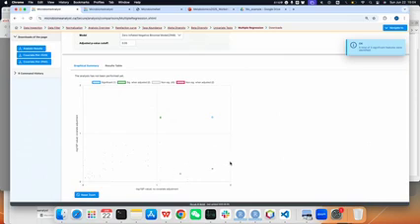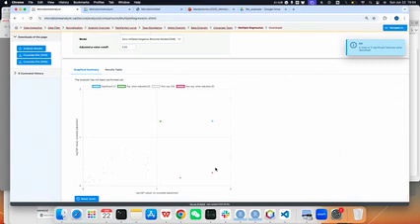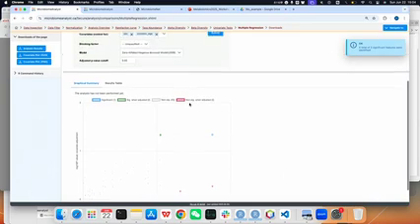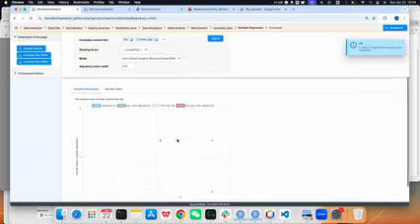Because 2 out of 3 features become non-significant when you adjust, you need to consider if this model is correct, because the significance is relatively small, so it's a little bit hard to tell about the model.